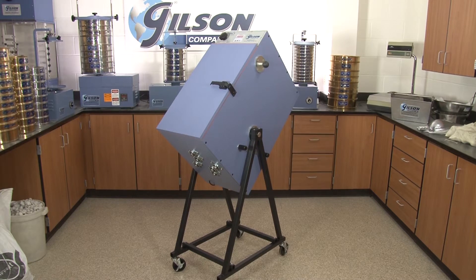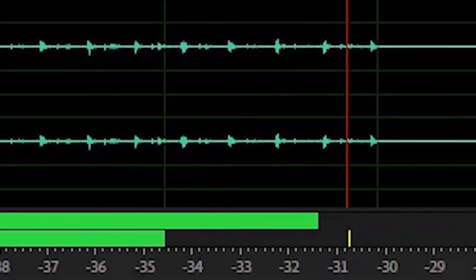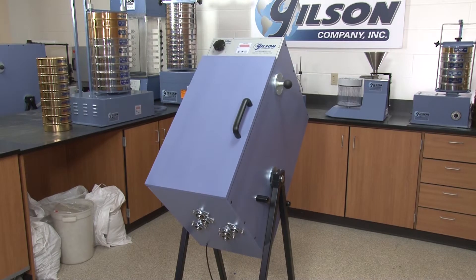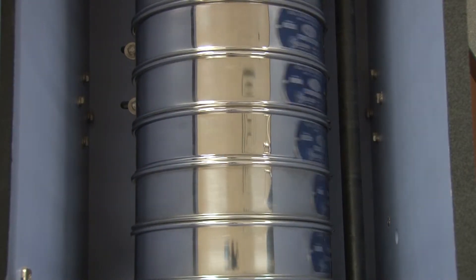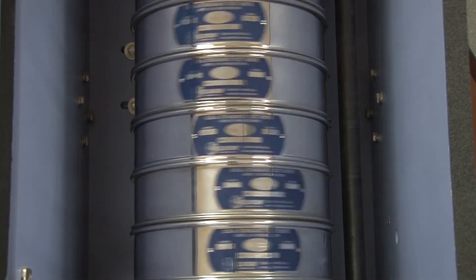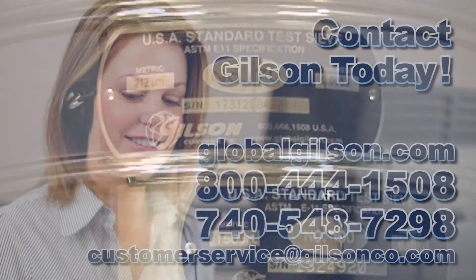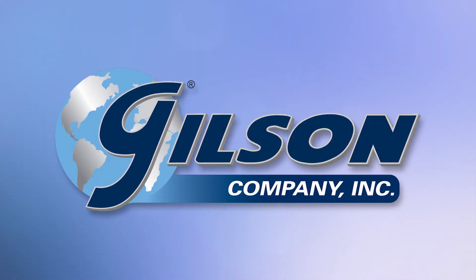From the high-performance Gilson laboratory silent sifters — the quietest rotary sifters on the market today — or the traditional rotary sifter such as the Mary Ann or the original Gilson rotary sifter, Gilson has the right laboratory rotary sifter to fit your needs for accurate particle size testing. Be sure to check out these and all our rotary sifters listed in the Gilson catalog and on the Gilson website. Gilson: your industry leader for materials testing equipment.